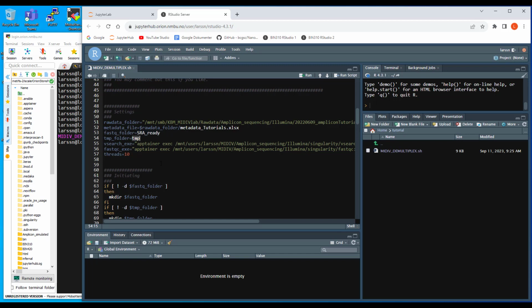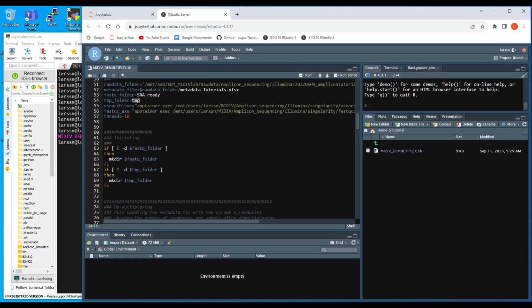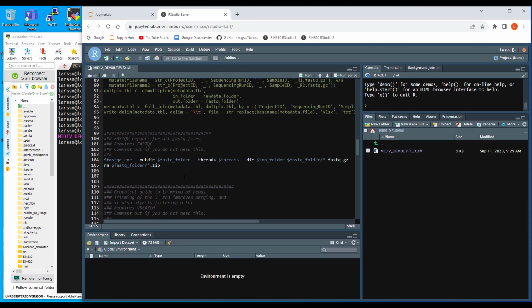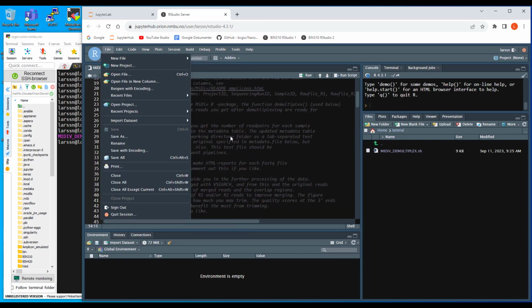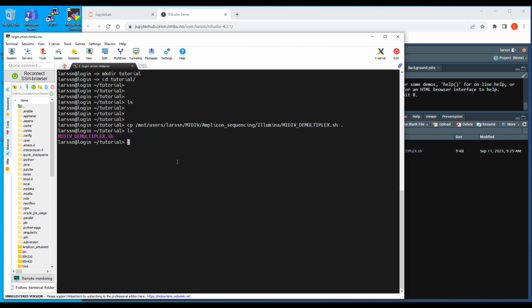And you need a temporary output folder that you can delete. It's for these temporary computations here. Vsearch and FastQC, yeah, we can see. And nothing else should actually be changed here now. So once you are happy with this, you save it. And of course, since I never changed anything, I don't need to save it. And then we just sbatch.